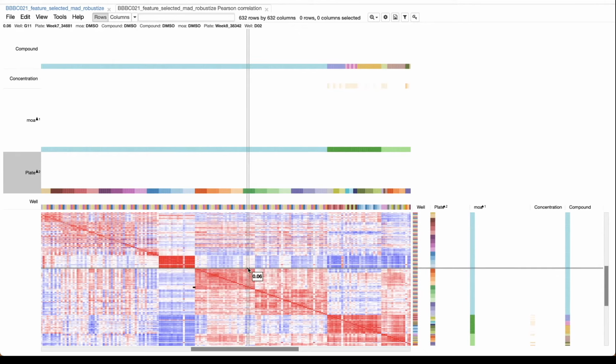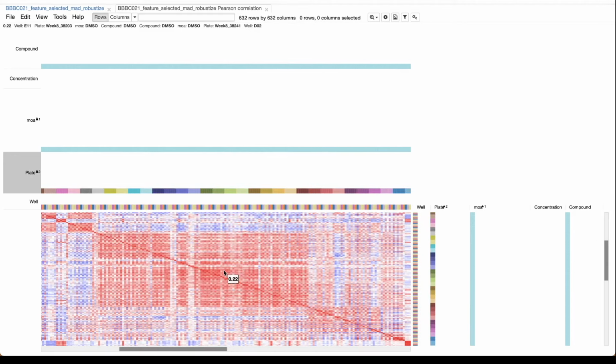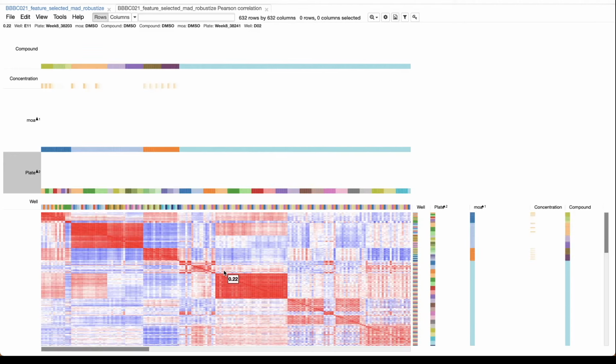One unfortunate artifact, or one unfortunate difficulty of cell painting and these sorts of morphological profiling assays being very sensitive, is that they are very sensitive to a lot of things, even sometimes things you wouldn't want them to be sensitive to, like which week your plate was run, in which batch, with which aliquot of reagents.